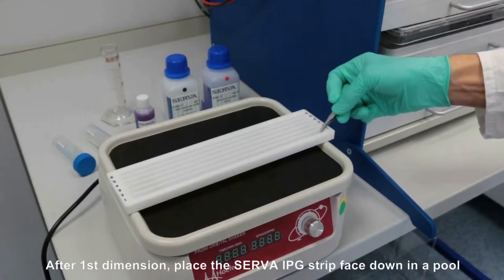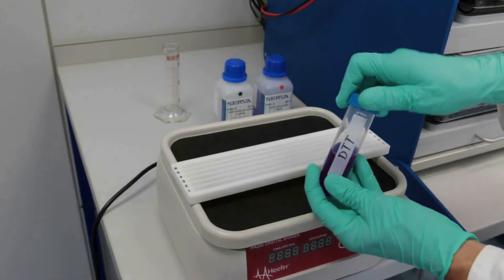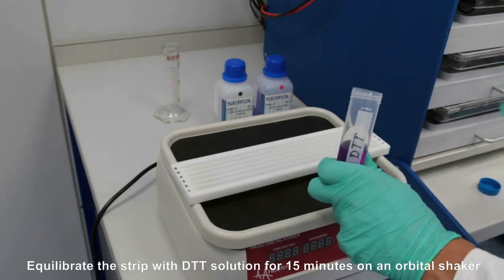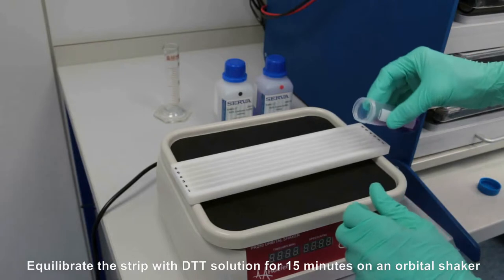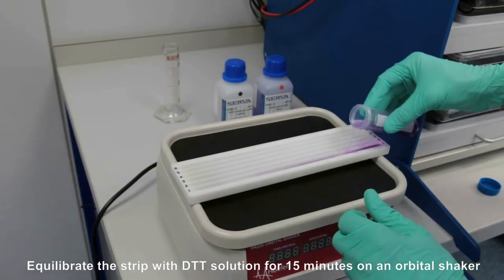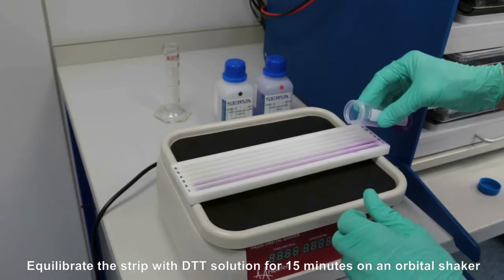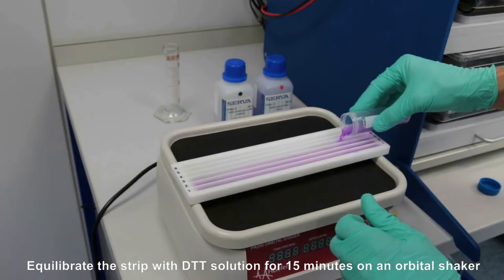When the focusing of the IPG strips is finished, place the IPG strips gel side down into a pool. Equilibrate the strip with DTT solution for 15 minutes on an orbital shaker.